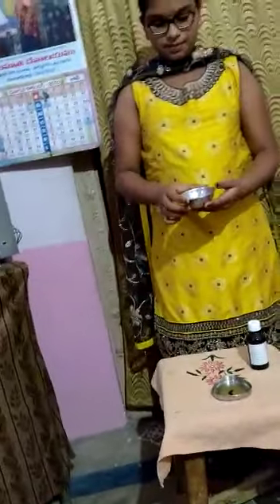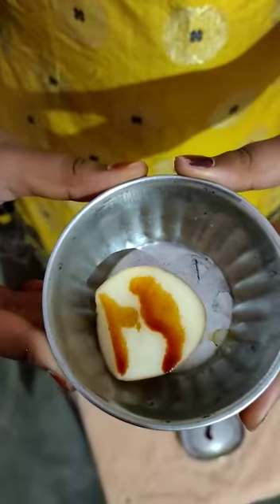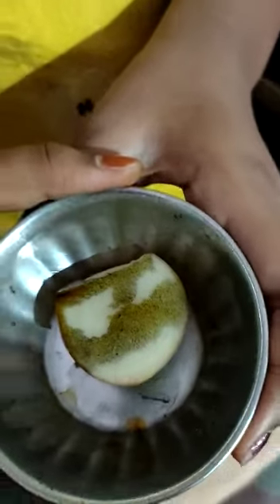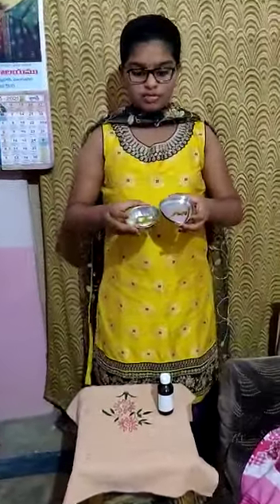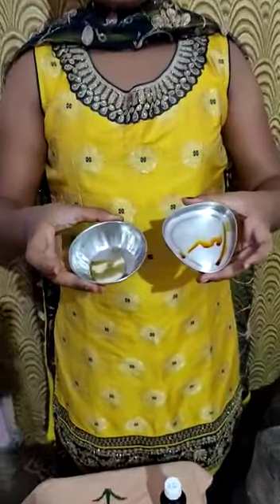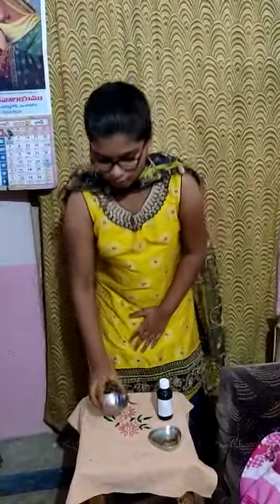Now observe it. Yes, it changes into blue-black color. Now see the difference of these two colors. Yes, the color changes into blue-black color. Now you can confirm it has starch.